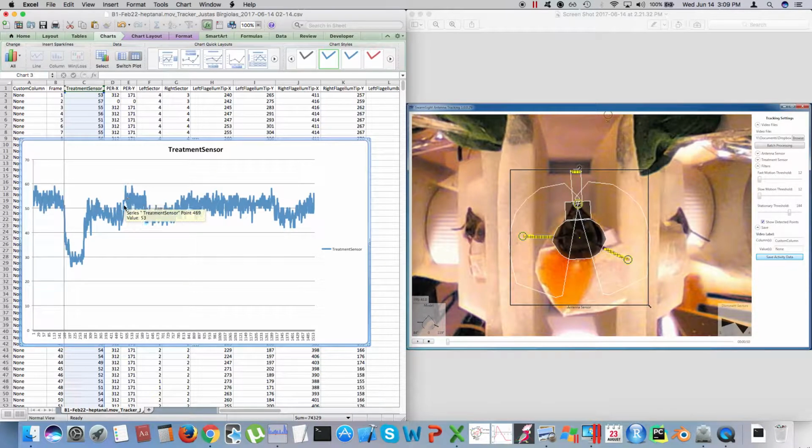Then a few seconds later, after the person was moving, you saw this red LED light diffusely coming out there. The reason is that the LED is positioned slightly to the side of the screen, so you can't see it directly, which is why the brightness only goes up a little bit over here.